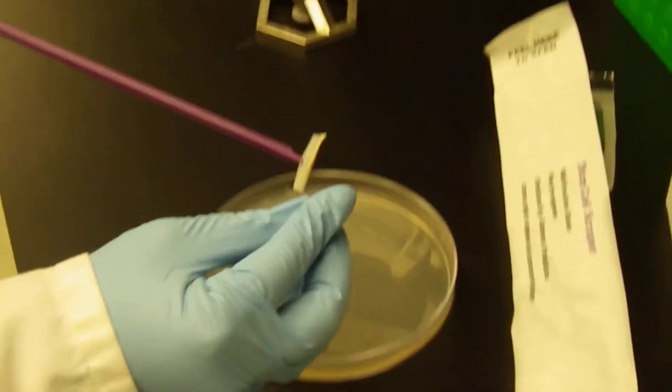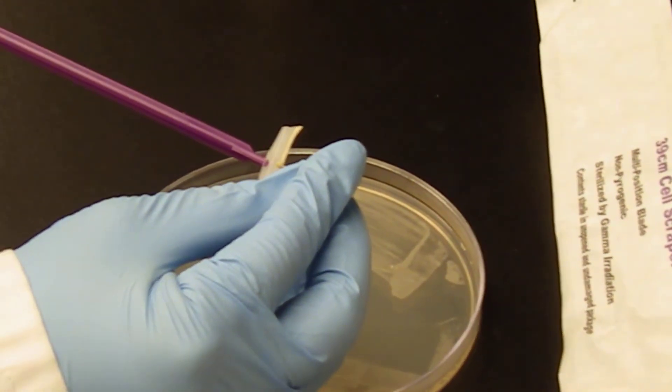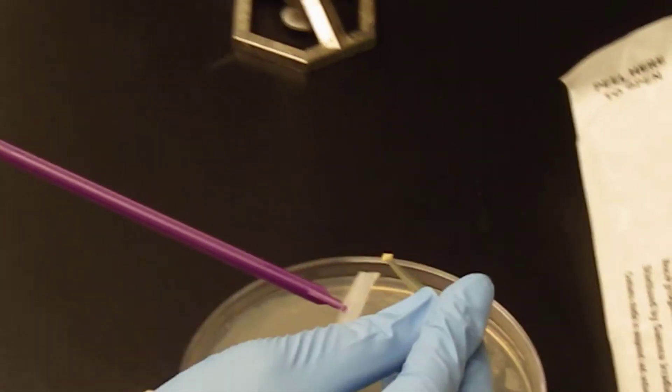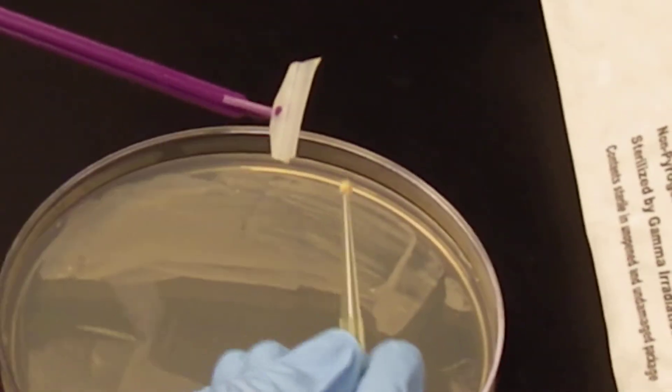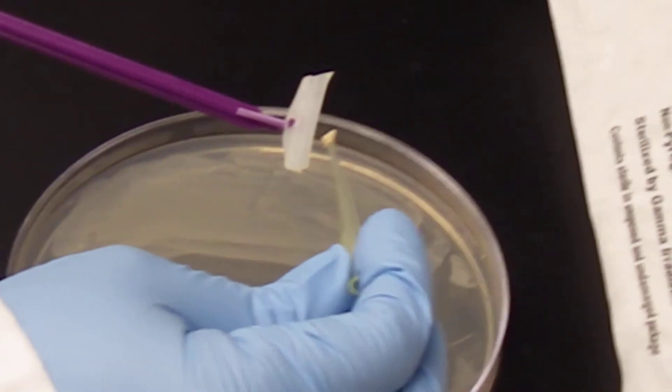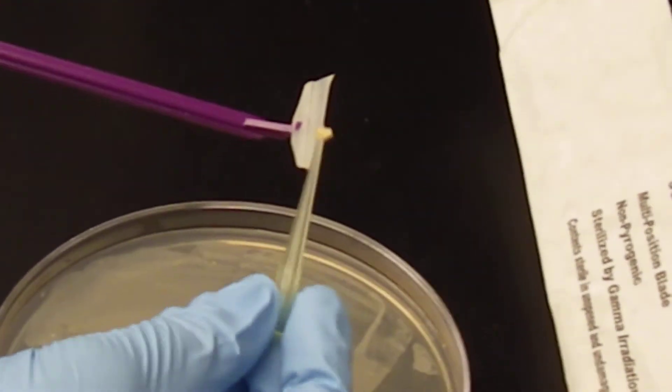and scrape the bacteria off the edge of the cell scraper, then take that and put it into a 15mm conical tube.